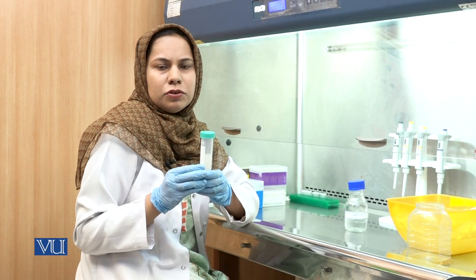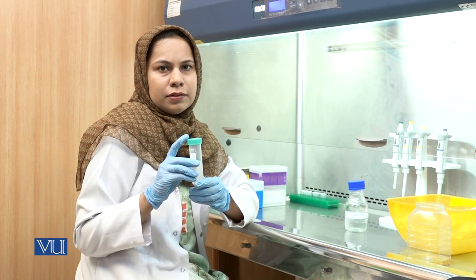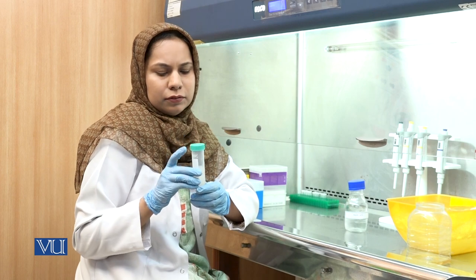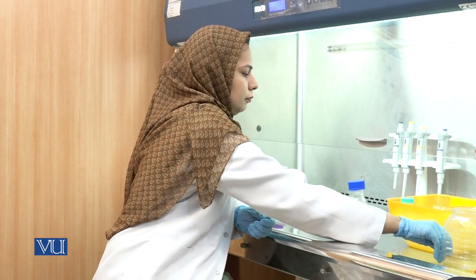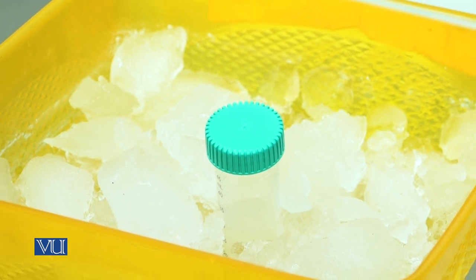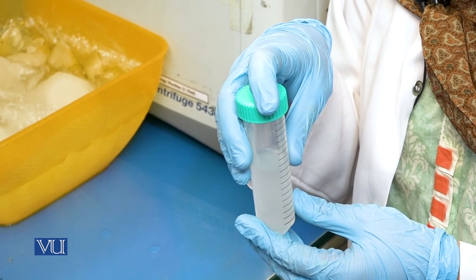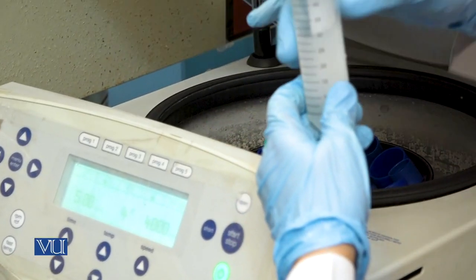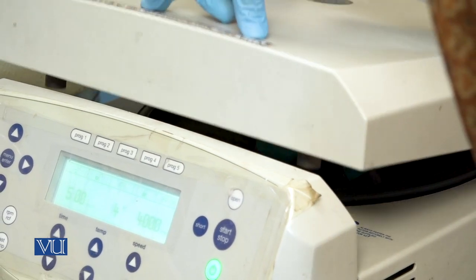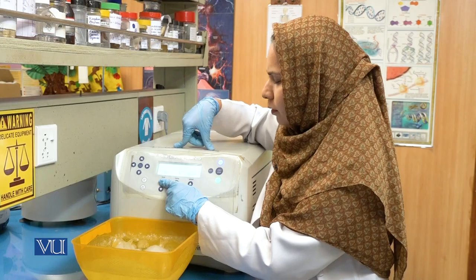After complete resuspension of the pellet, we will put this culture in ice for about 10 minutes and then centrifuge again to obtain the pellet. Bacterial suspension in calcium chloride solution after incubation needs to be pelleted down. For this, we will centrifuge this at 3000 g, 4 degrees centigrade and 5 minutes.